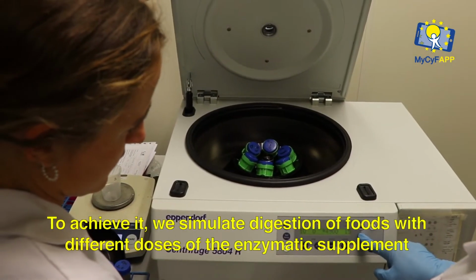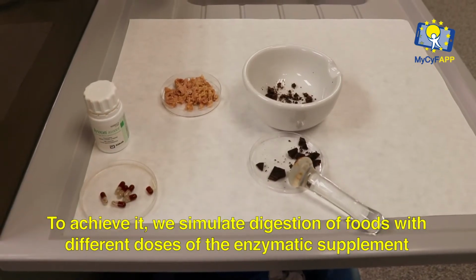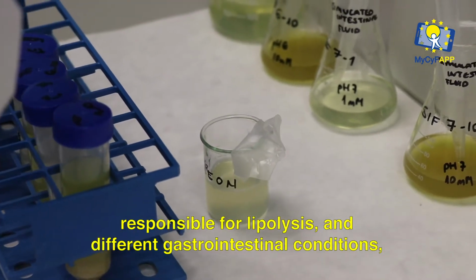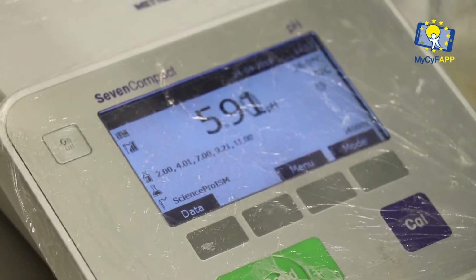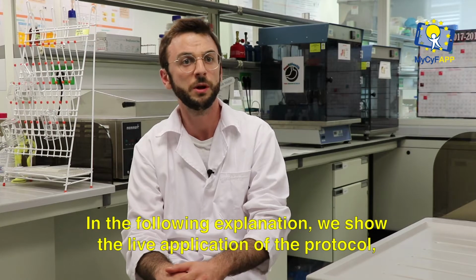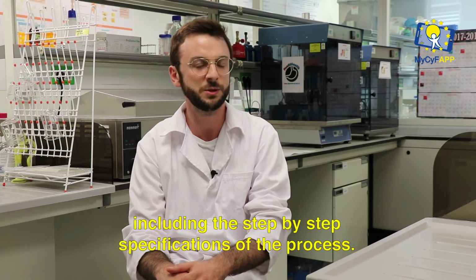To achieve it, we simulate digestion of foods with different doses of the enzymatic supplement, which is responsible for lipolysis, and different gastrointestinal conditions such as pH or bile salts concentration. In the following explanation, we show the live application of the protocol from the sample preparation, including the step-by-step specifications of the process.